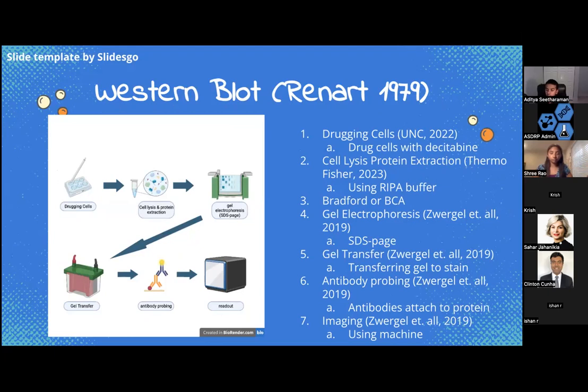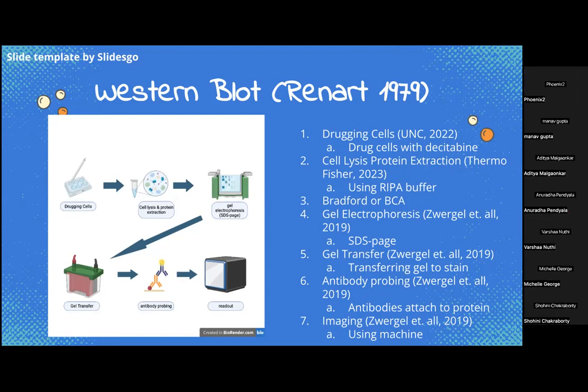And next, the protein is separated through something called gel electrophoresis, specifically something called an SDS-PAGE. So the gel serves as kind of a filter, which filters the protein based on its molecular weight, which is compared to a protein ladder, which we already know the molecular weights of. And as a part of gel electrophoresis, buffers are added to charge the protein negatively, and allow it to travel to the positive end of the gel, as well as to ensure movement of the protein to the other side.